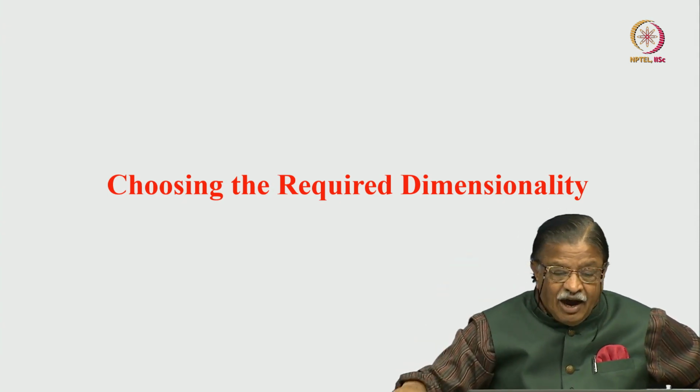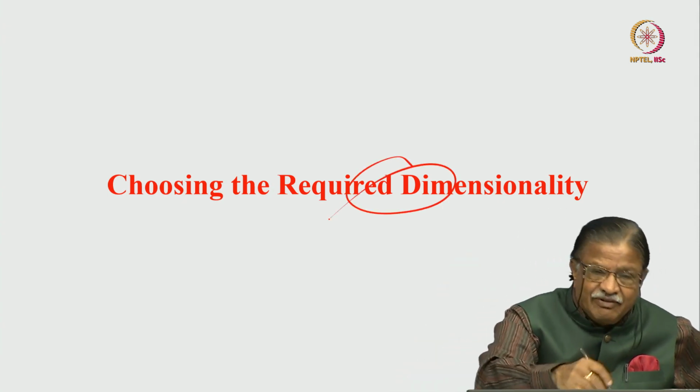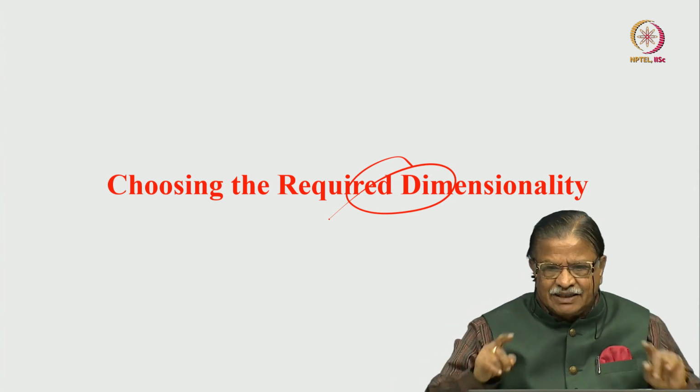But the question is, how do you choose the required dimensionality for a given molecule? That we will discuss in the next class.